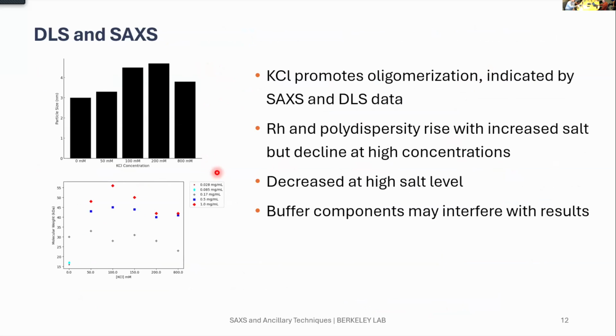And finally, just to compare DLS and SAXS profiles, here we also see the molecular weight correlation with potassium chloride, similar to what was shown before for particle size in DLS.